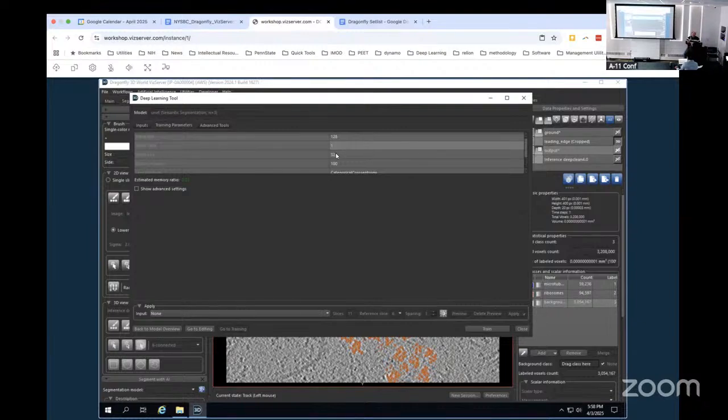Okay. Forget stride ratio. Basically, it says, are you going to take out patches that aren't overlapping or are overlapping? So if you want overlapping patches, you need more data. Say you have a very small data set, you want to get more, quote unquote, out of it. You can turn the stride ratio down. So 0.5 will mean that they're 50% overlapping.